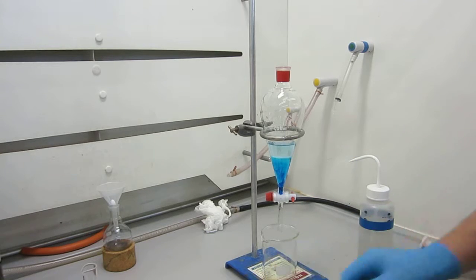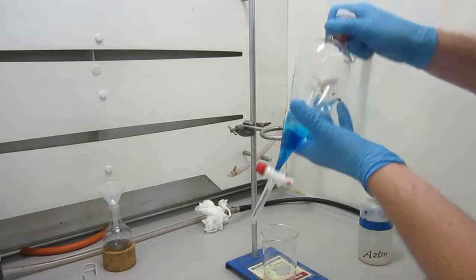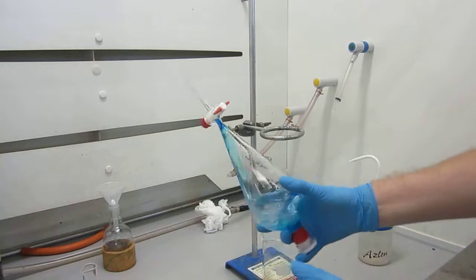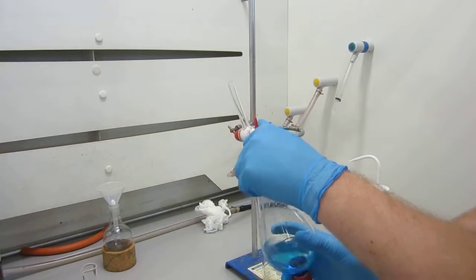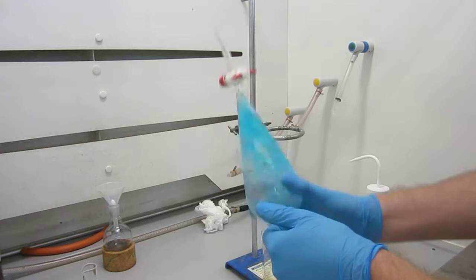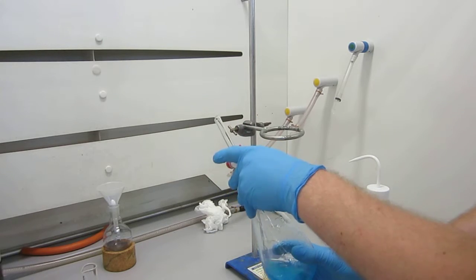Right, so we're going to put the stopper in, invert, with my little finger I'm going to hold the stopper on, invert it, and vent it. You'll hear it hiss. So it's good practice, as soon as you've inverted it, to vent it. And then going to shake it around, swirl it around, and vent. You want to do this about 5-6 times.